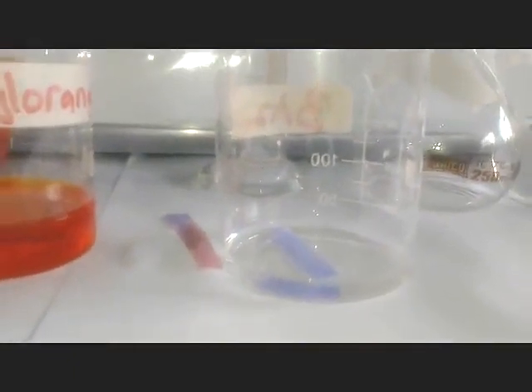But let us put a red one. This one is going to prove that that is a base. Red one, I put inside. There we go. The red one is also turning blue. That one indicates that this is a base.